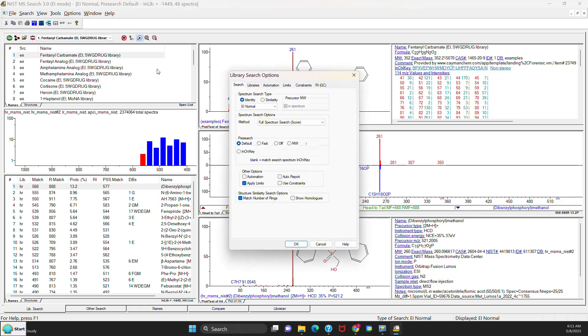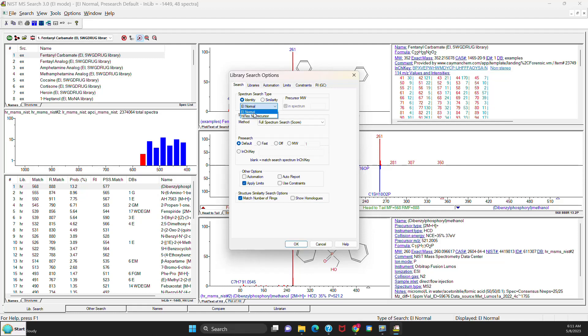Now when you go to the Library Search Options, the menu will be highly simplified. If you pull down the Identity Type searches, you'll get the EI for Normal, which is the low resolution or nominal mass. And you'll see the other one is for EI High Resolution, which they've changed the name here.